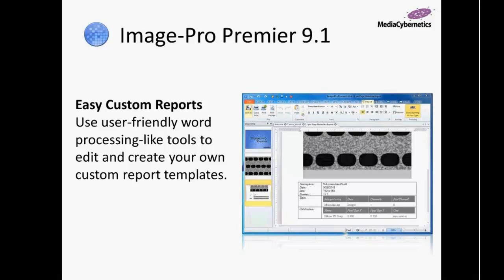A nice interface on the top for you to use bold and italics, for you to align the data and all the information you want. You can simply bring in images and reports full of columns and rows of data that you've counted or that you've manually measured in the product on any of the other tabs. A very nice product that we're very excited about bringing.